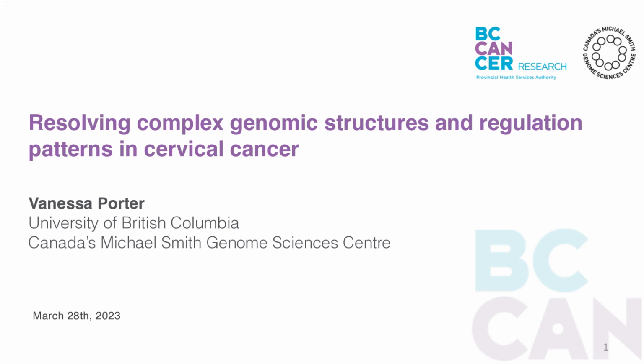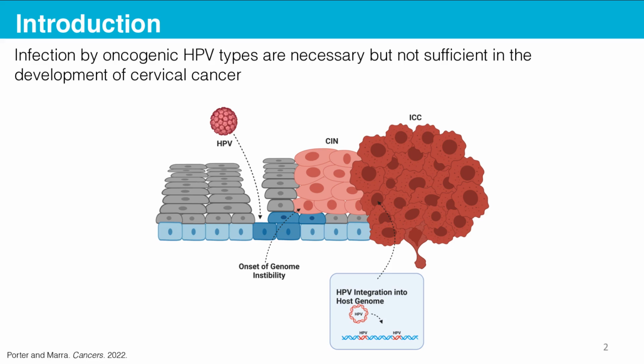Welcome everybody. As mentioned, I'll be talking about how I use nanopore technology to resolve complex genomic structures and regulation patterns in cervical cancer. So HPV is necessary but not sufficient in the development of cervical cancer.